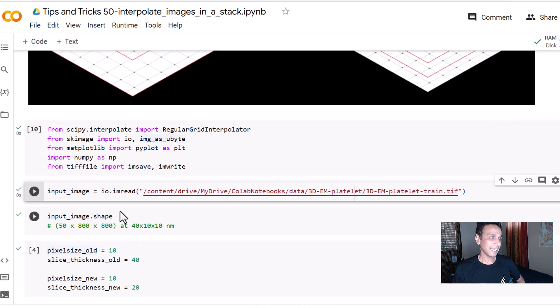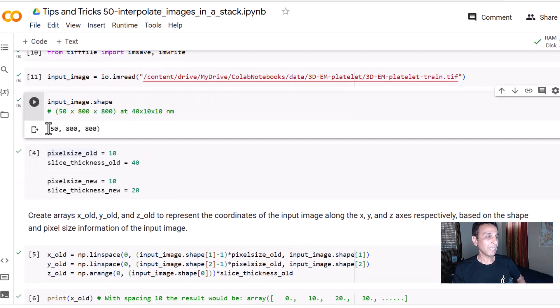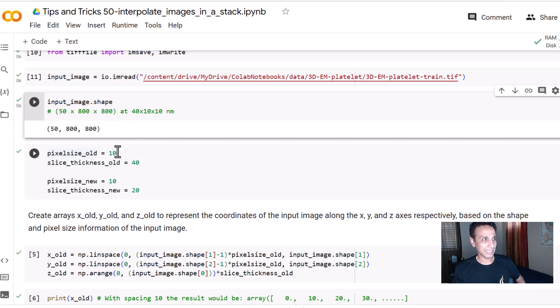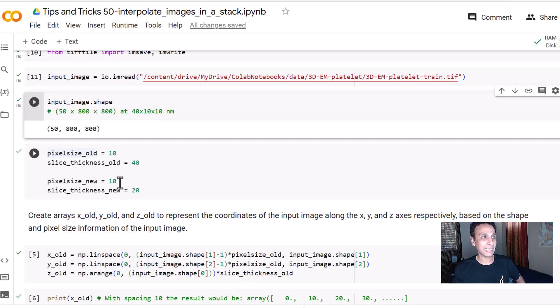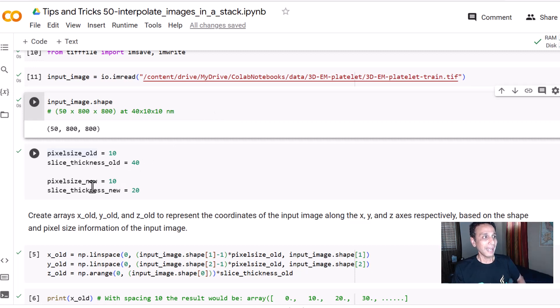Our input image has 50 slices in z and 800 by 800 in x and y. Let's define our old pixel size as 10 and old slice thickness as 40. Our new pixel size — let's leave x and y at 10, and the new slice thickness we want is 20. You can also interpolate to other sizes, but let's stick with 20 for now.